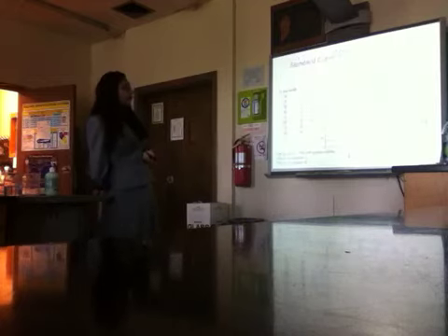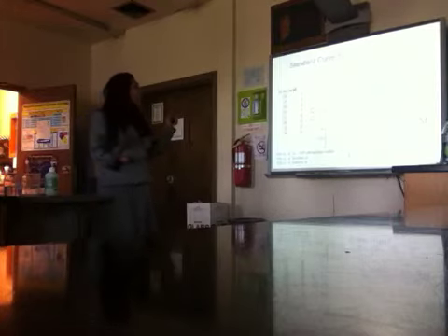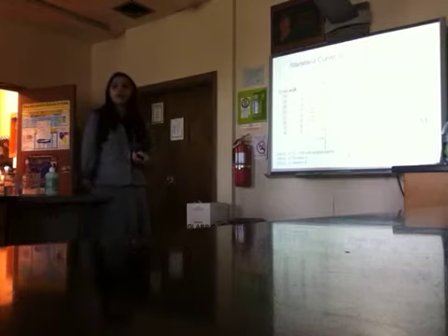For the standard curve for the Griess reagent, I used different concentrations from the stock solution of sodium nitrite, ranging from 20 micromolar to 250, and I found the extinction coefficient of 0.0051, with an error bar of plus or minus 0.0002.